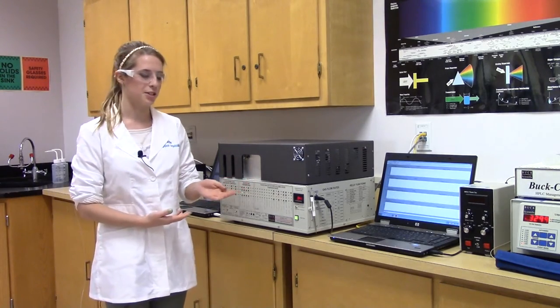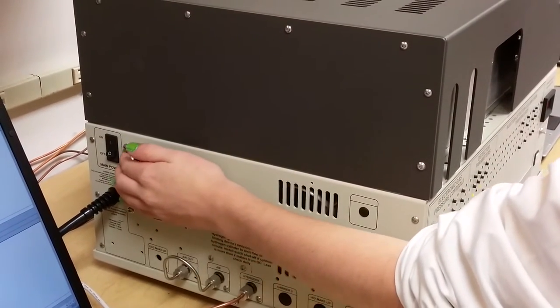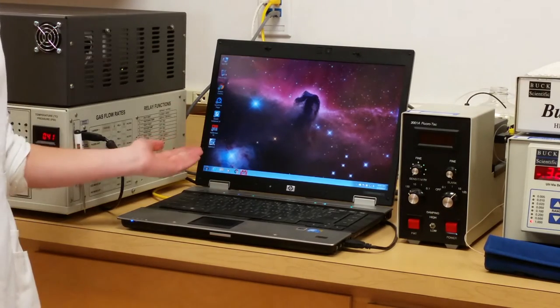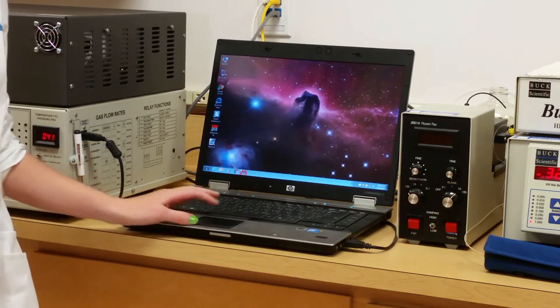First step is to turn on the GC. The switch is located on the side of the instrument in the back. The program we will be using today is called Peak Simple. It's located on the desktop in a red and gray box. When opened, it looks like this.